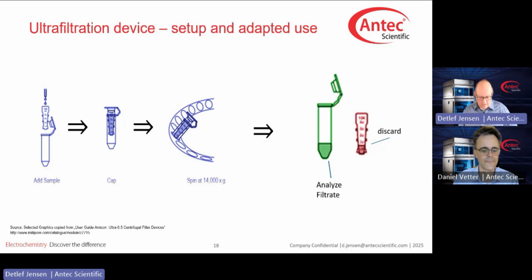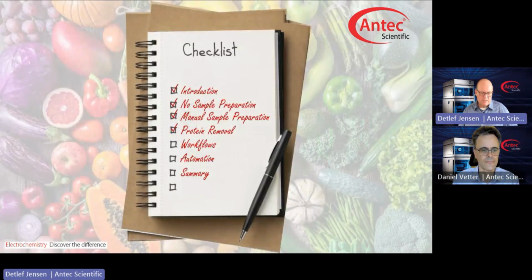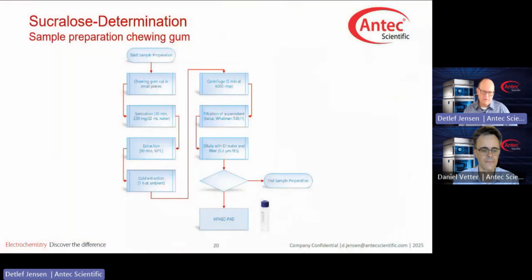So we stay in the context of sample preparation, and what's next on the checklist, that is workflows. Workflows. Why do I talk about workflows? Again, this is a workflow describing a sample preparation. I don't want you to read all the fine print, because it is a busy slide. So it's very difficult to read.